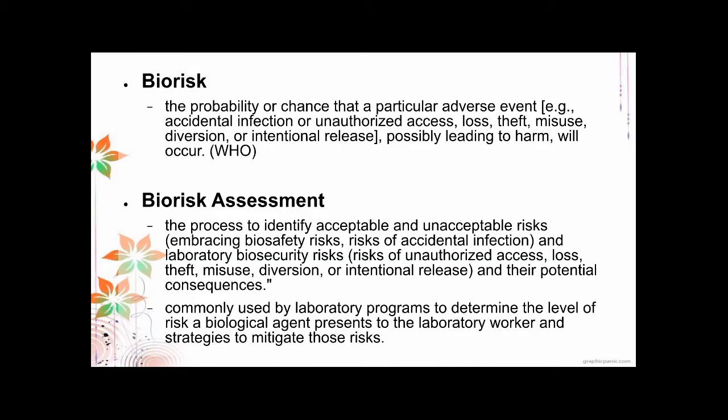Biorisk encompasses both biosafety and biosecurity. In terms of biorisk, you're measuring the probability that the safety or the security might be jeopardized. This is commonly used by laboratory programs to determine the level of risk a biological agent presents to the laboratory worker and strategies to mitigate those risks. When you design laboratories or programs and protocols, there's always a biorisk assessment involved as one of the first steps.